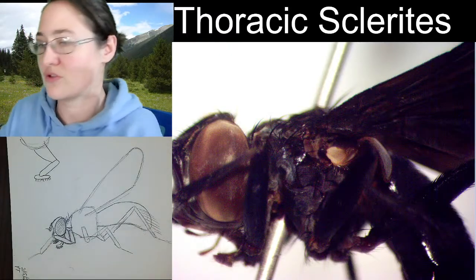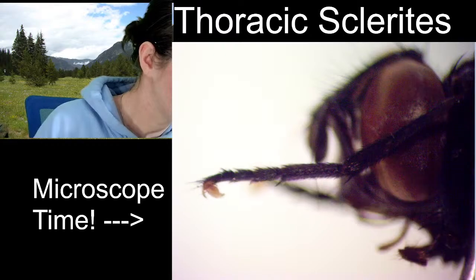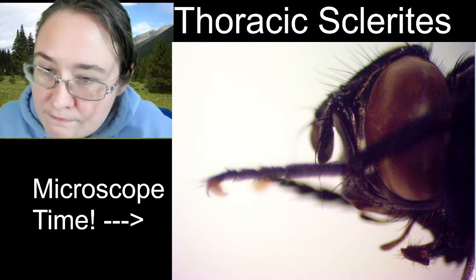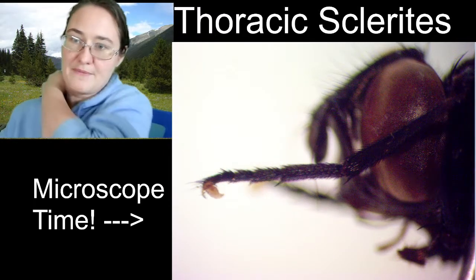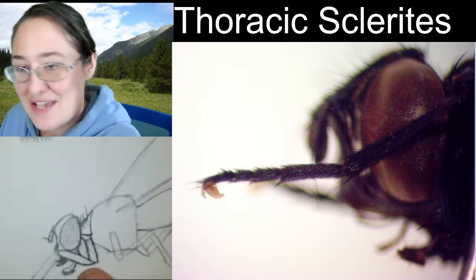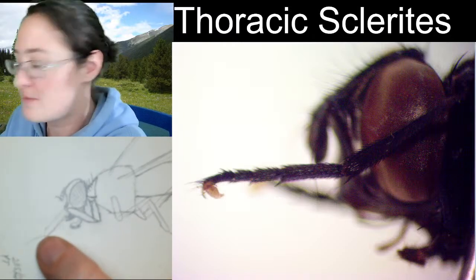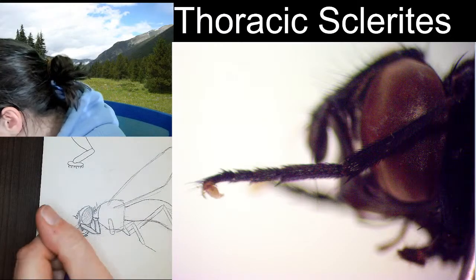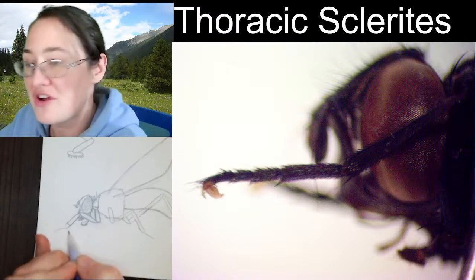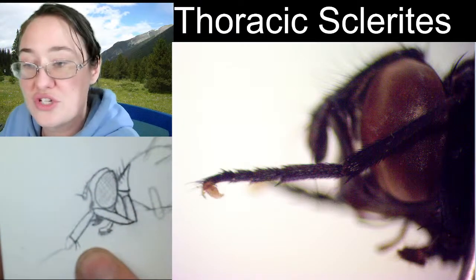And now we're going to scooch the microscope forward just a little bit so we can see the tibia. The tibia on the front leg, or what we would call the protibia, is approximately the same length as the femur. However long your femur is, you're going to make the tibia about that same length. There are two tibial spines. I know that there are a handful of us out there who love to hear about the tibial spines. Those spines are on the underside here, so I'm going to add those cute little spine friends.